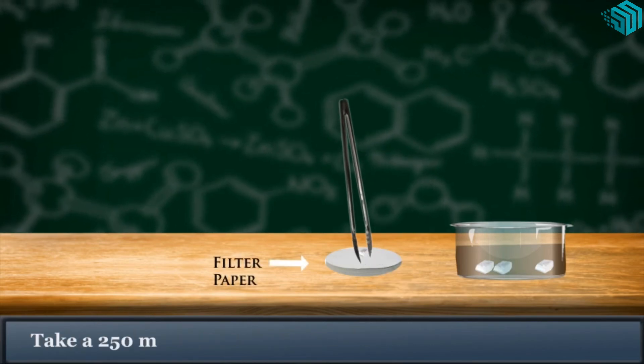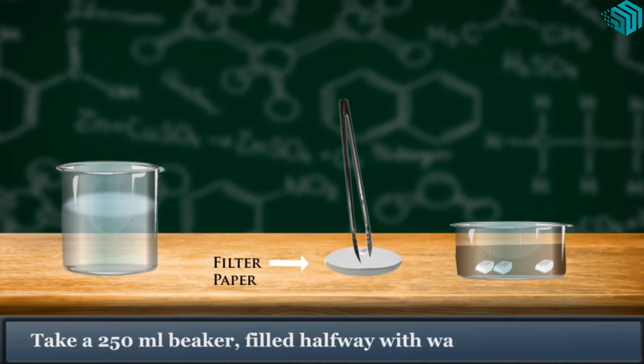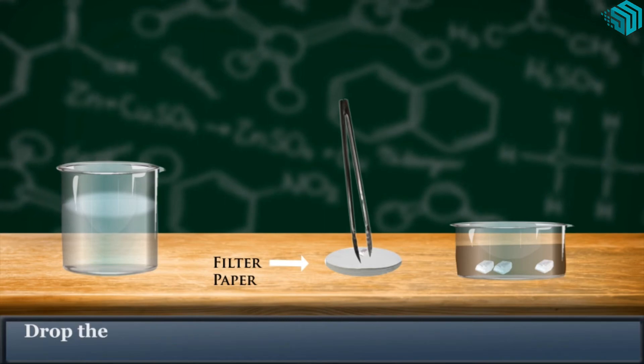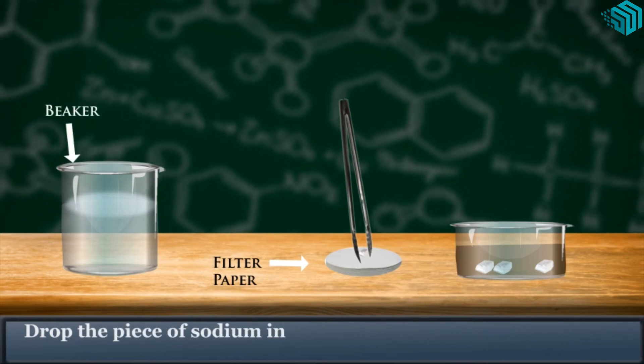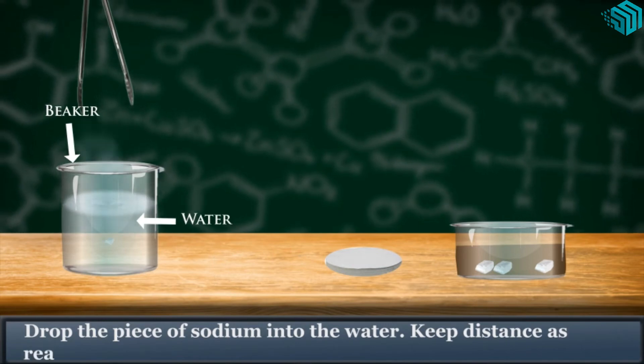Take a 250 milliliter beaker filled halfway with water. Drop the piece of sodium into the water. Keep distance as reaction is vigorous.